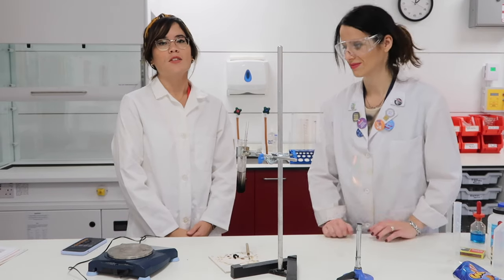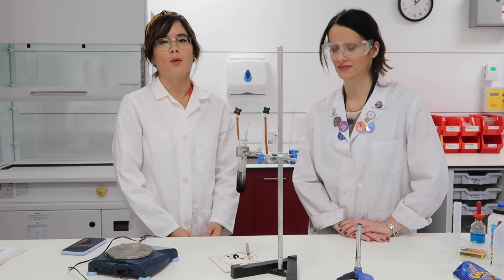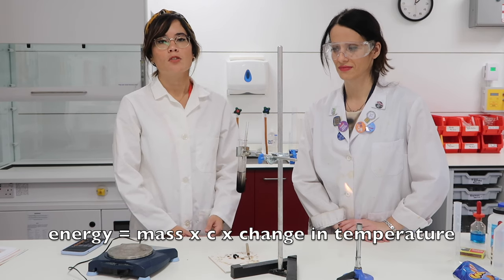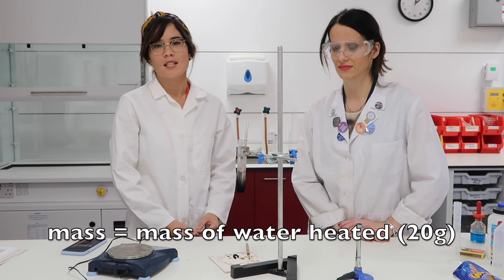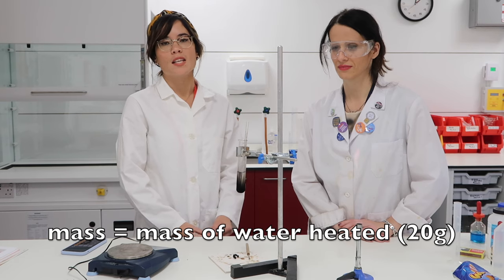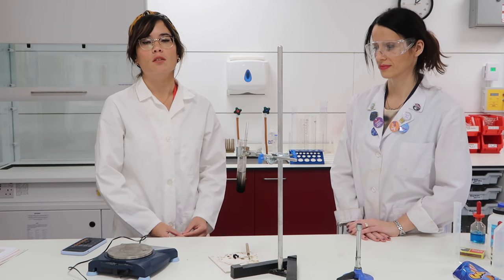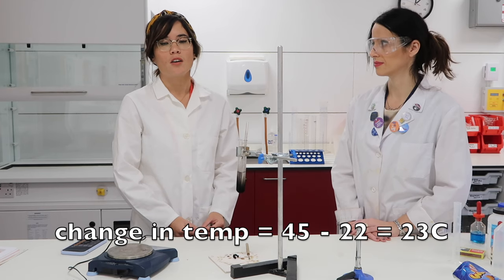To find E, the amount of energy released by that food, we use the equation: energy equals mass times specific heat capacity times change in temperature. Crucially, the mass is the mass of water heated — so 20 centimetres cubed of water is the equivalent of 20 grams of water. So we do 20 times the specific heat capacity of water, which is 4.2.